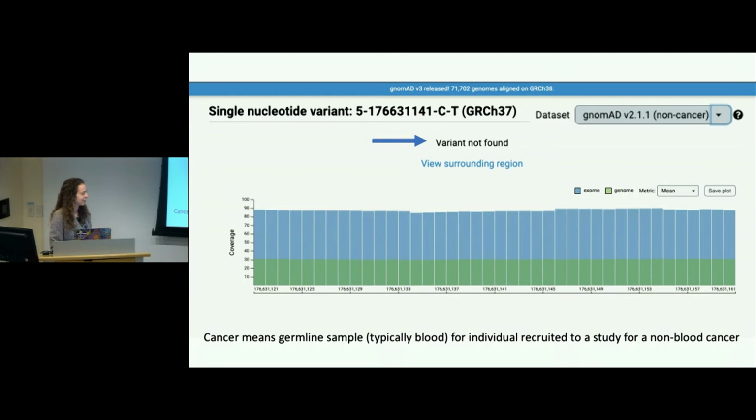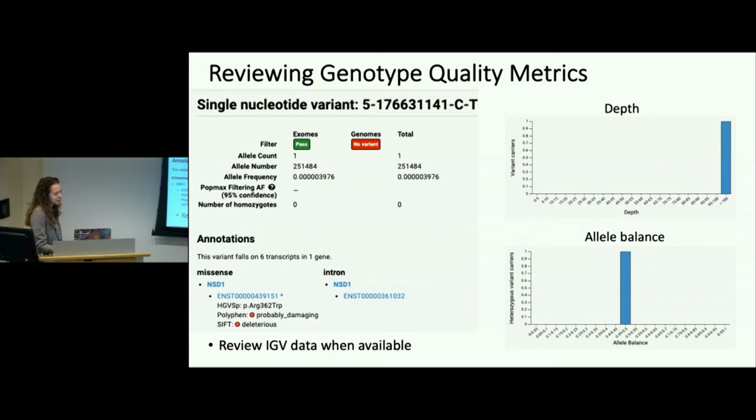So this individual that has this variant in ClinVar, which I think is misclassified, comes from a cancer study. That is the extent of phenotype information that we have on the individuals in gnomAD. The other thing I can look up is the person's age, rounded to the nearest five. If I was interested, we actually don't have age for this cohort, so I don't know for this individual.